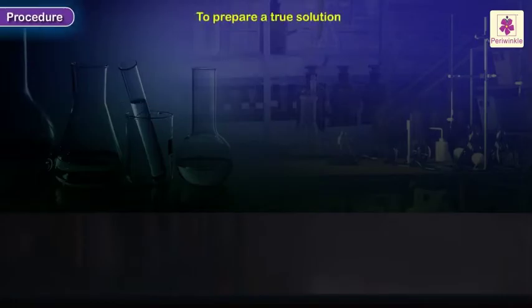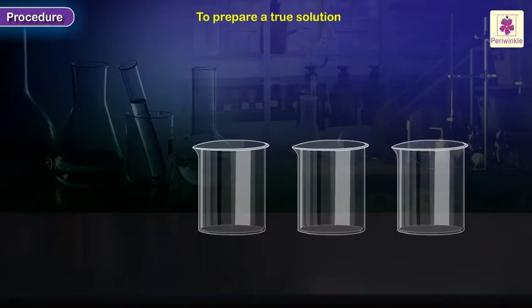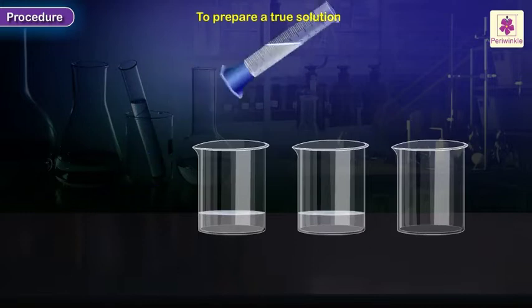Procedure: Take three clean beakers with 25 ml of distilled water in each. Label them as A, B, and C.